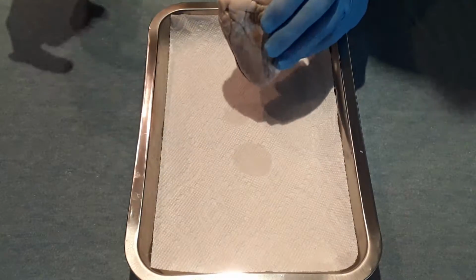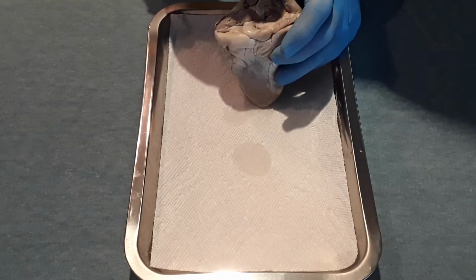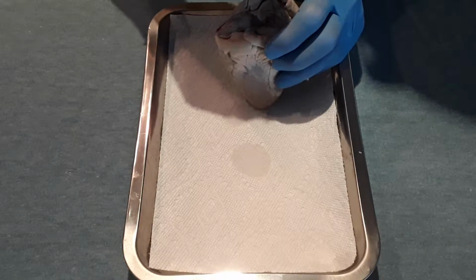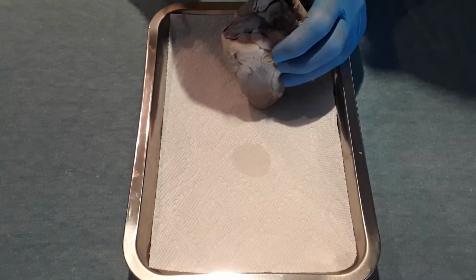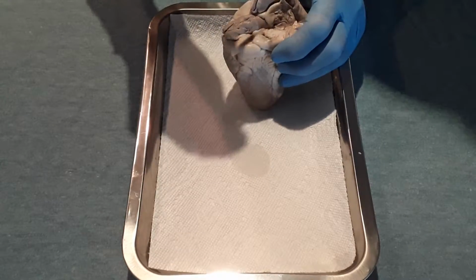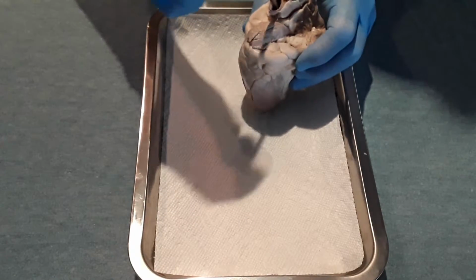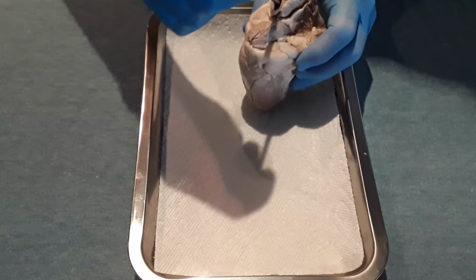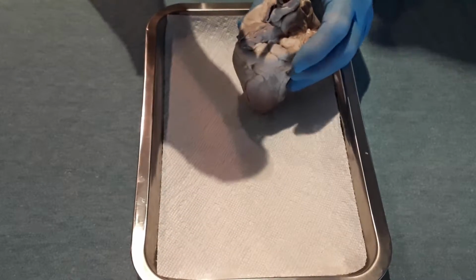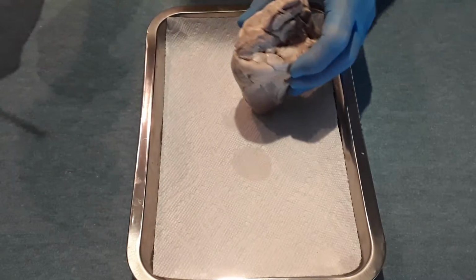A couple of the major vessels on the back of the heart. This here is the superior vena cava. It returns all deoxygenated blood back to the heart through the right atrium. This one is the pulmonary trunk. This takes blood from the right ventricle to the lungs, where it is oxygenated. And this one is the aorta. It carries all oxygenated blood to the rest of the body.